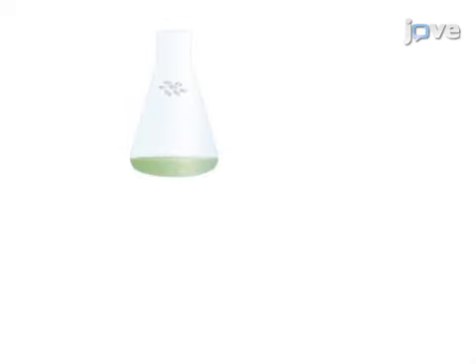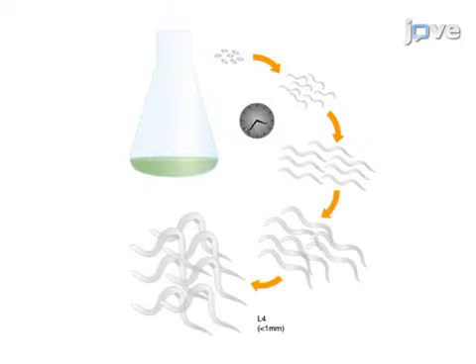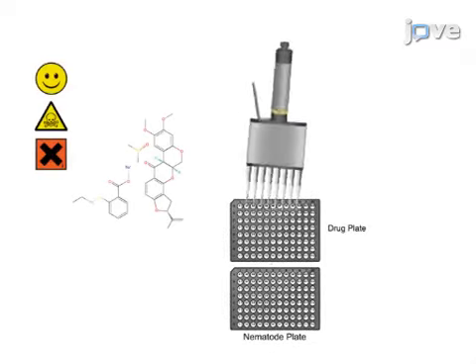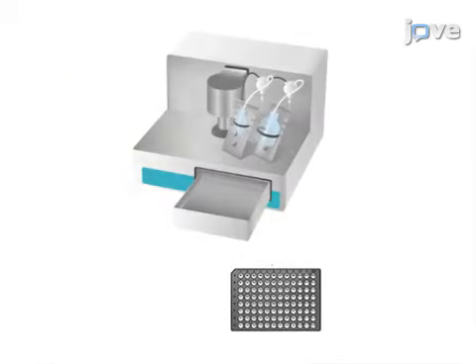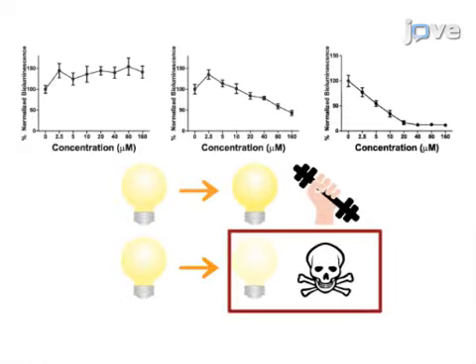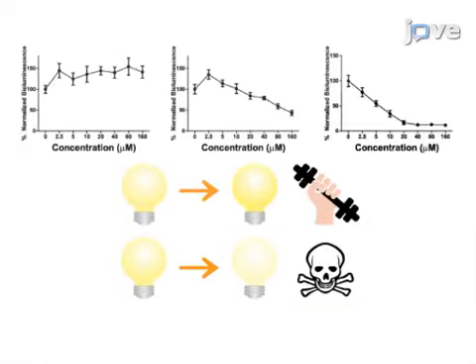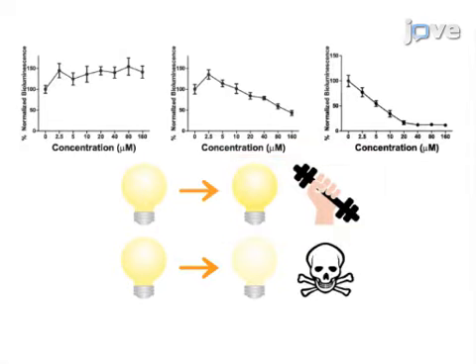During a typical assay, a population of developmentally synchronized worms is grown to the L4 larval stage. The nematodes are then treated with the test drug compounds for a period of time prior to the measurement of both fluorescence and bioluminescence. Results show potential drug toxicity when bioluminescence is reduced. An enhanced signal indicates a hit for further testing for beneficial effects on mitochondrial function.